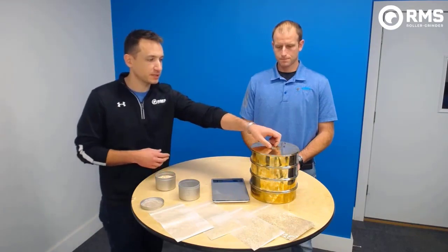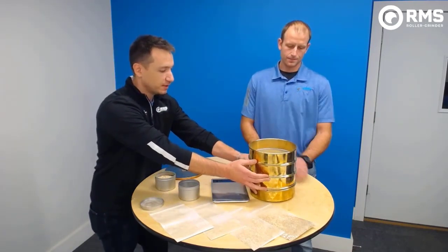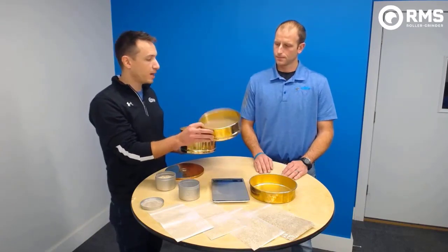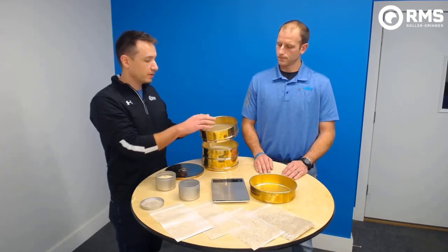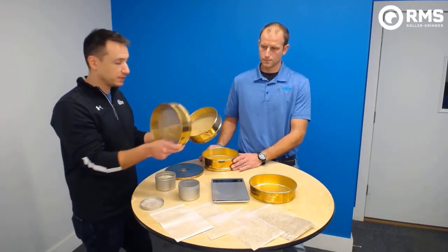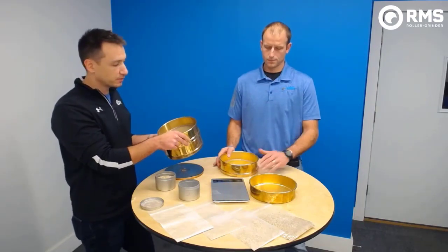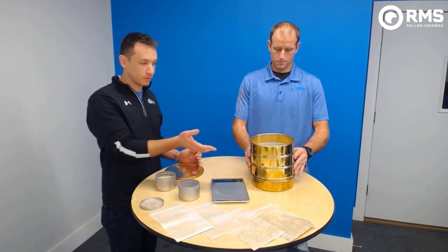What comes in this kit? You have your sieve set, which consists of a cover to keep things a little less messy, and your three sieves. A sieve is a little container with a mesh bottom, and that mesh has a specific spacing based on the size of the sieve. This is a number 14 sieve — the opening is a certain micron distance from the other openings. Going down the set: this is your 14, this is your 30, and this is your 60 sieve — it gets finer as you go down, letting smaller and smaller particles through. The bottom one is your pan, a flat plain pan to catch any fine material left over after passing through the three sieves.